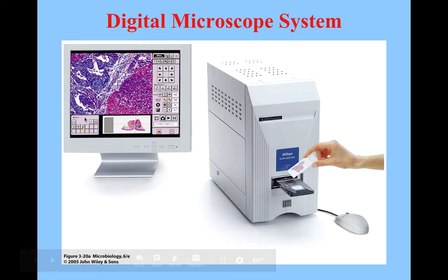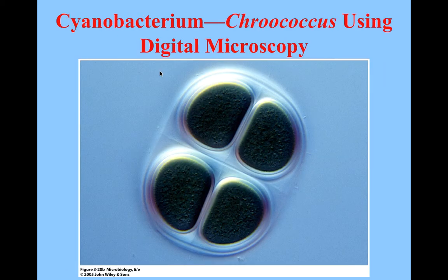I talked about that on Monday. You click and say, okay, how big is this? You can do magnification. You can rotate it. You can do all kinds of cool stuff. Here is a bacterium using digital microscopy.